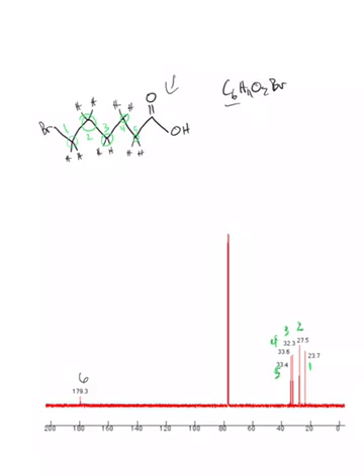And so for the sixth carbon environment, we see that it is here, and it is directly bonded to the oxygen via the double bond here, and bonded to this alcohol group here. So we would expect this carbon to be shifted downfield the furthest. So we see that this is going to be right here, which corresponds with number 6.